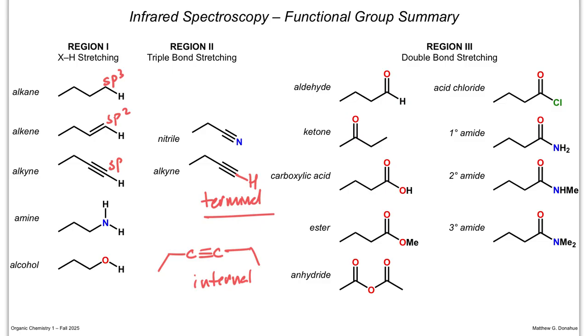Aren't those two the same? The one to the left, both of the... Yeah, these are the same. What this region is showing you is this stretch, CH, and then what this region is showing you is the CC.